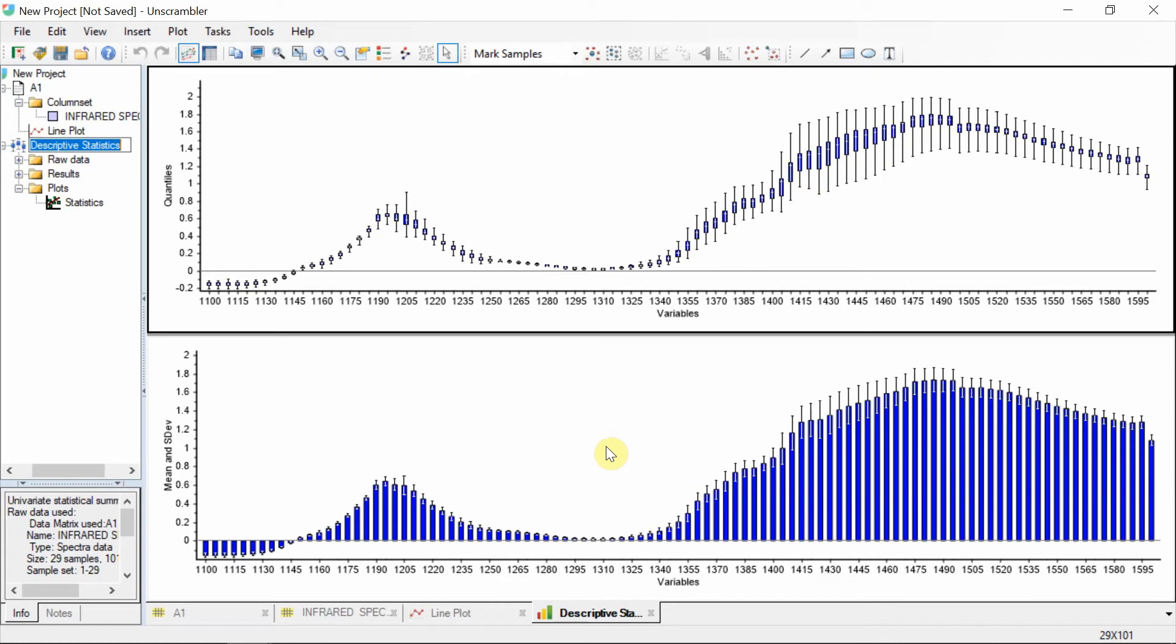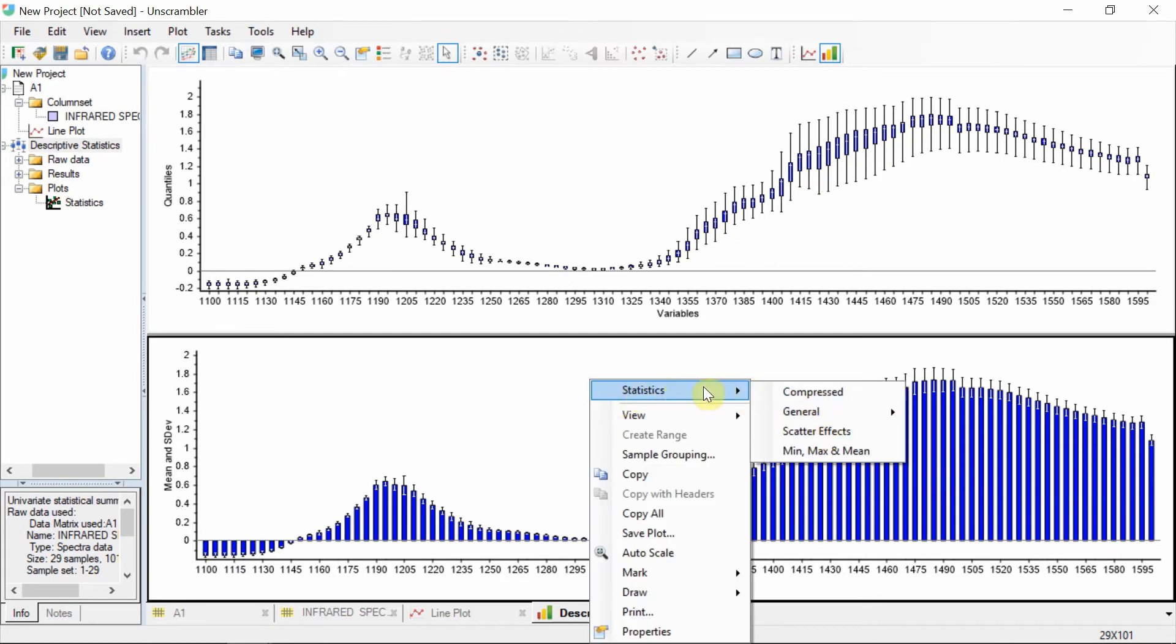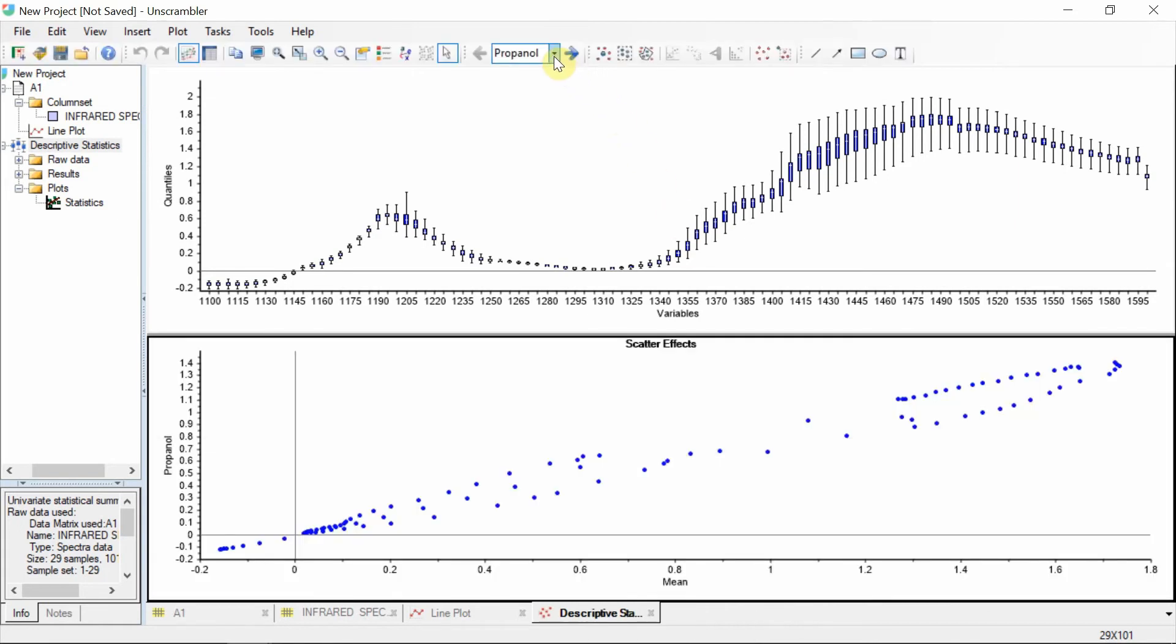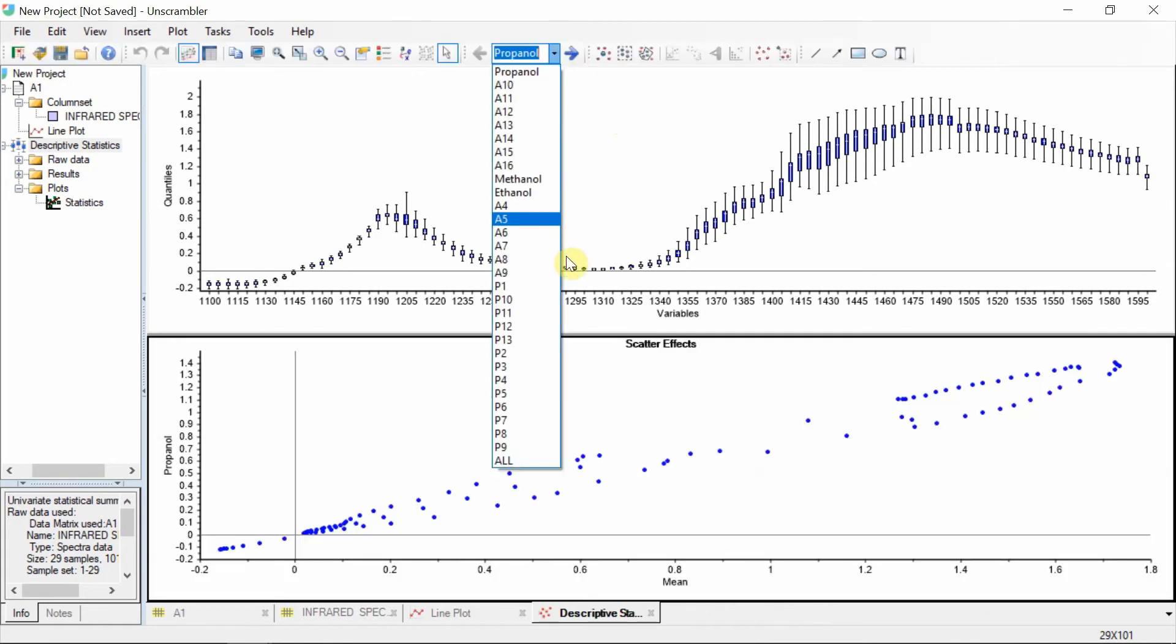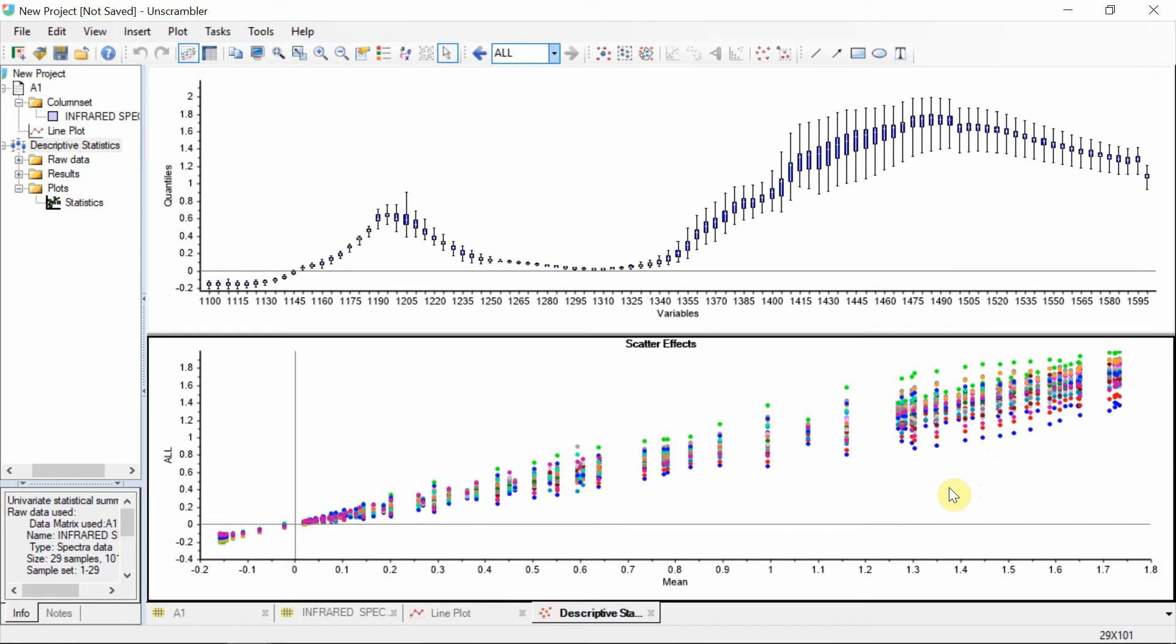We can look more into this by selecting the scatter effects plot within the statistics menu. We can select which samples we want to plot from this drop-down menu. Select all samples. This pattern of widening towards the end is indicative of multiplicative scatter effects, which typically arise due to interferences like differences in particle size.